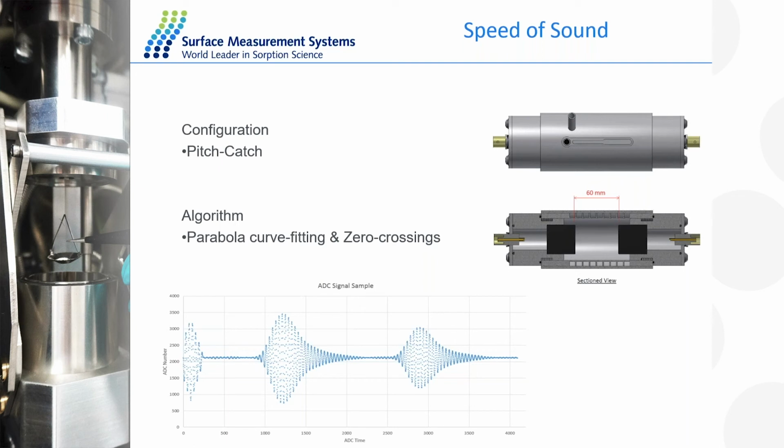Obviously, if you think about the presence of extra molecules in a chamber, you will imagine that introducing more molecules of a solvent will increase the time of flight, which consequently can be measured and calibrated. So what we do to measure the concentration of organic solvent is measure the time of flight of a carrier gas and then measure the time of flight of a carrier gas plus solvent, and use that change in value to calculate the relative humidity or partial pressure of that specific solvent.